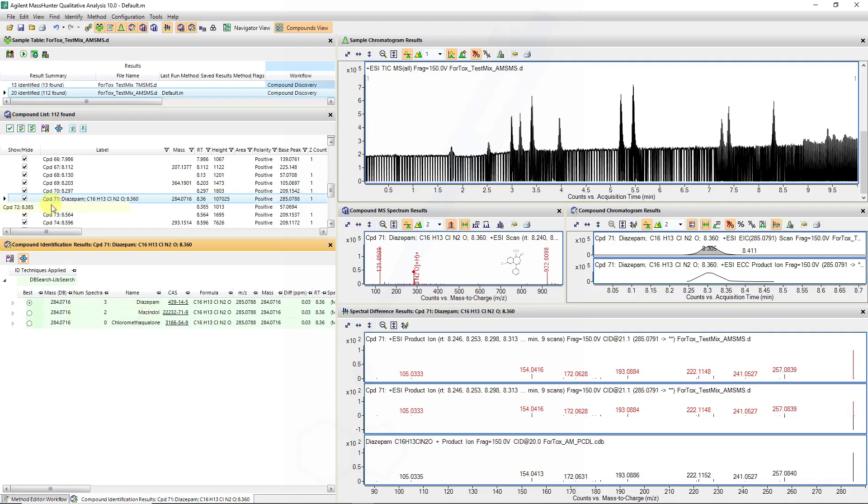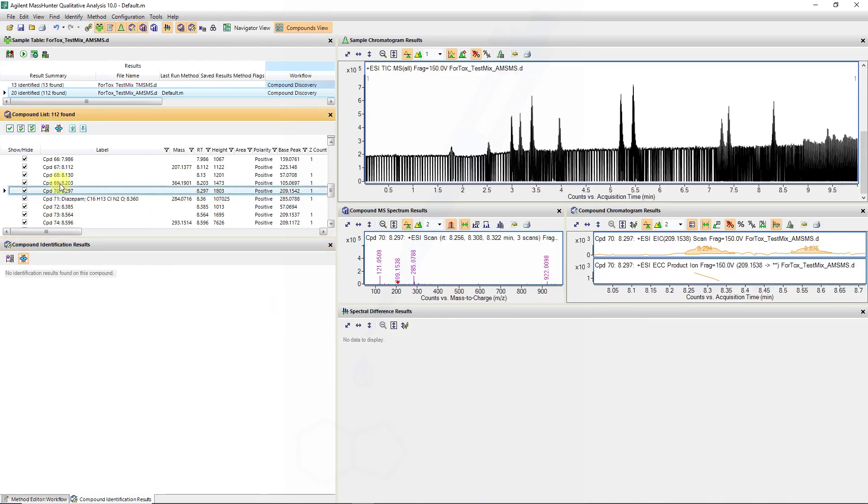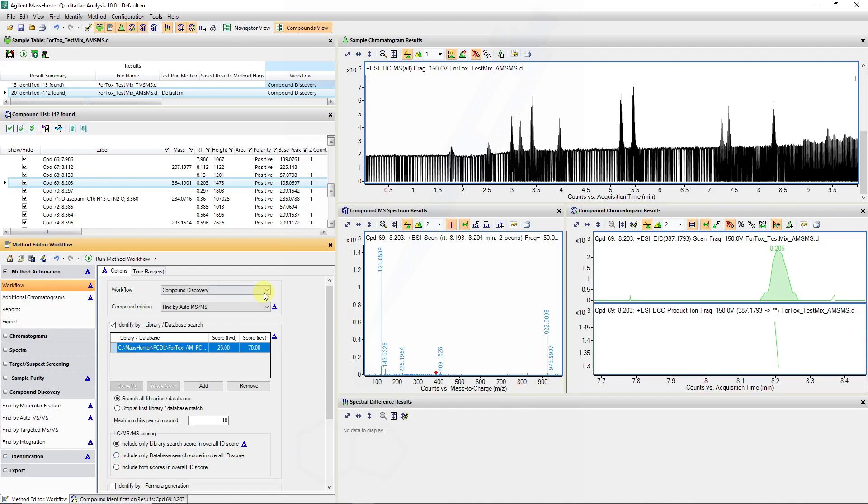And additional molecules have been identified from the MFE algorithm which you can then do additional formula prediction if you do identify by formula generation. So you can generate formulas for these and then potentially go to the molecular structure correlator once you've got this MS-MS information to try and find potential compounds.